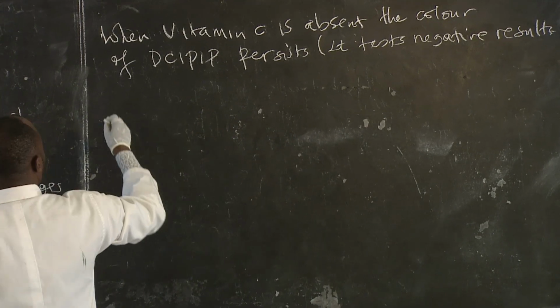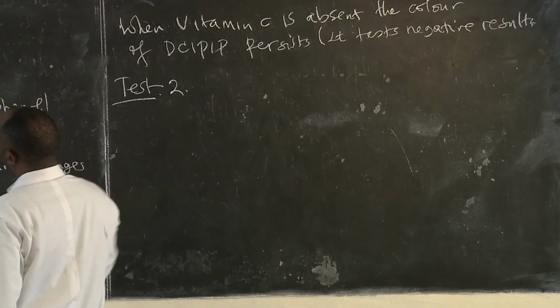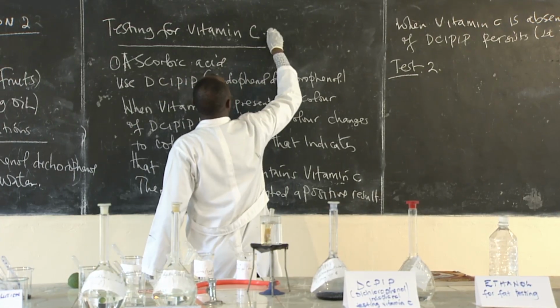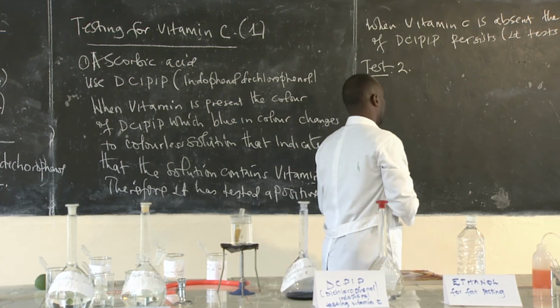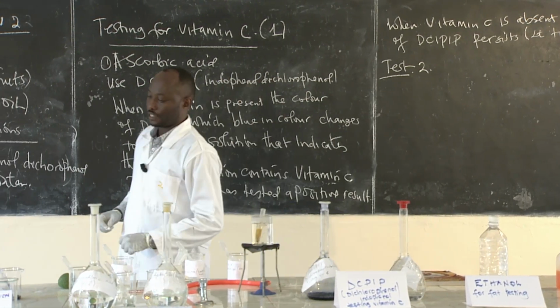Then test 2. I can say this is test 1, and say this is test 1. Then test 2, we are testing about the fats.